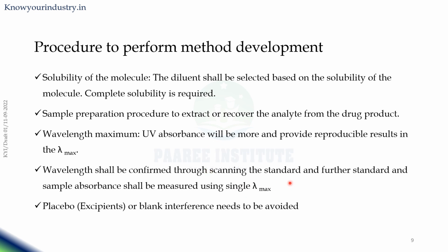Then the interference by the placebo or the excipients or the blank can be avoided or nullified using the blank interference or placebo interference. This sample can be kept in another cuvette and can be nullified.